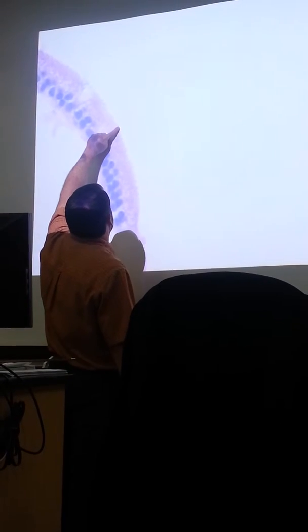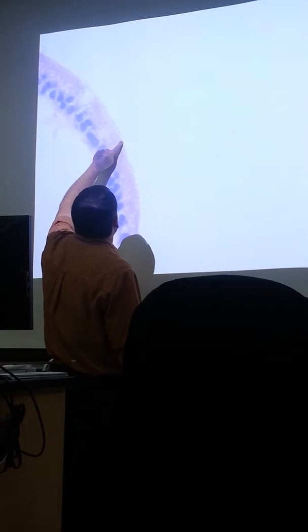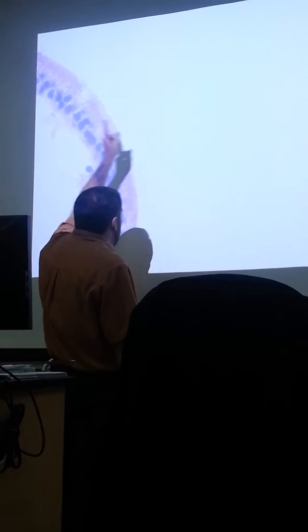So now I've gone really close, and look at this. I'm seeing the tiny things that are on the surface of the cells. What are those called? Villi. No. Microvilli. If I'm on the third objective lens of the microscope, it should help you remember that these are not villi, but microvilli. They're the tiny, tiny parts of the surface of the cell.